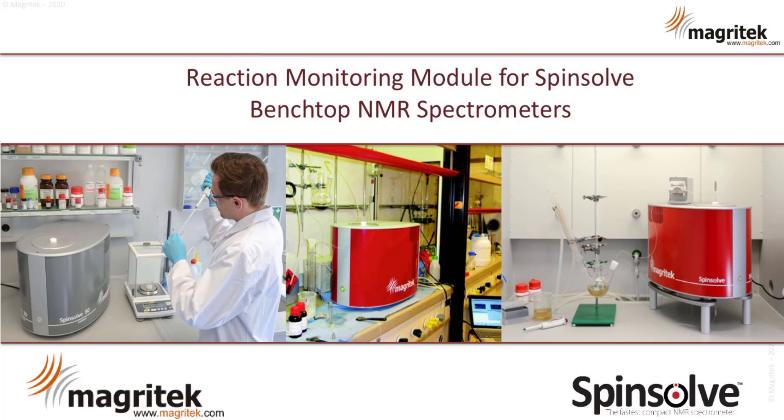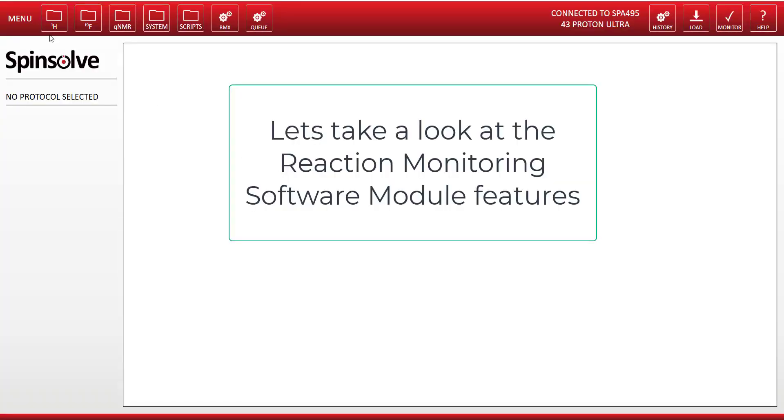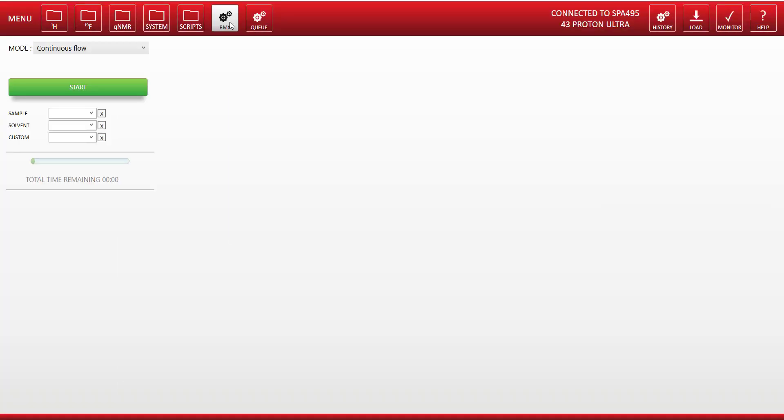In this short video we're going to take a look at the reaction monitoring module for the SpinSolve software to be used with the hardware reaction monitoring setup.